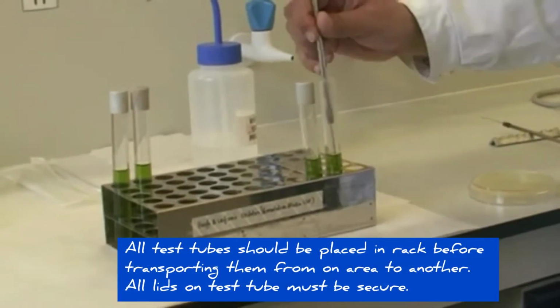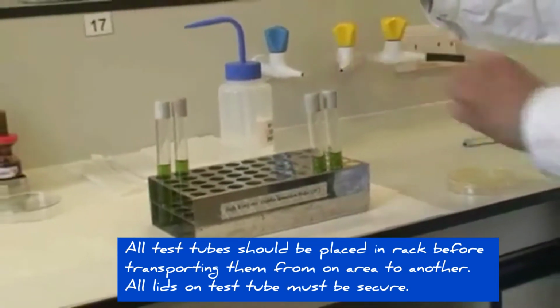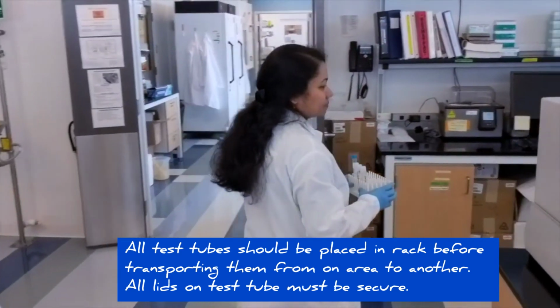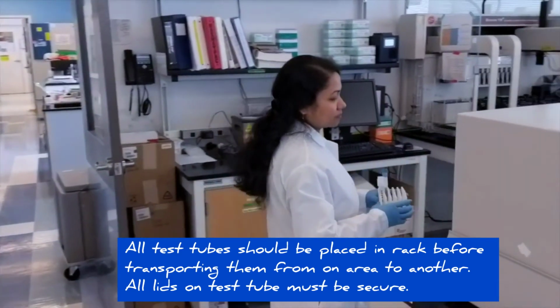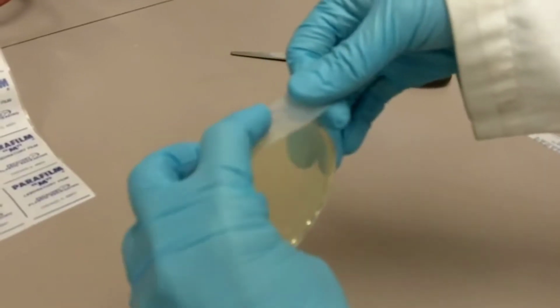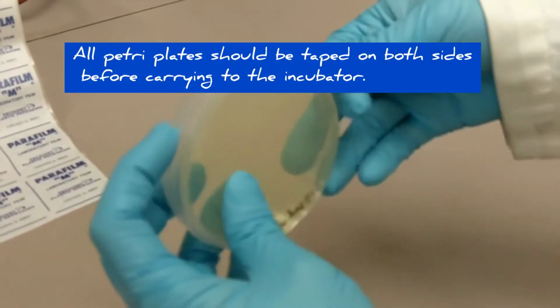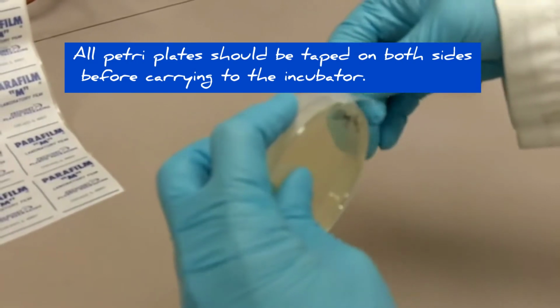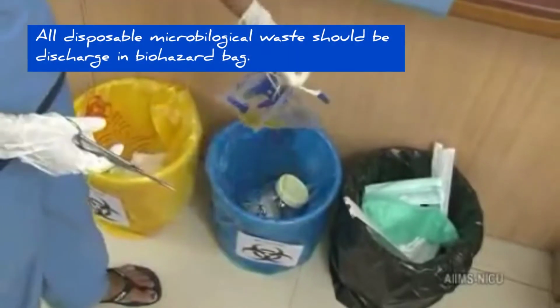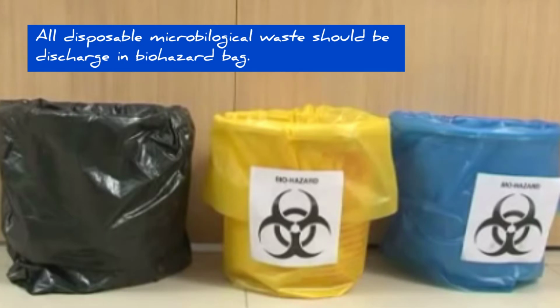Now, rule number 5. All test tubes should be placed in a rack before transporting them from one area of the lab to another. All lids on all test tubes must be secure. Rule number 6. All petri plates should be taped on both sides before carrying them to the incubators. Rule number 7. All disposable microbiological waste should be discarded in the biohazard bag.